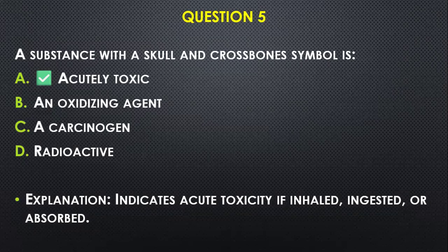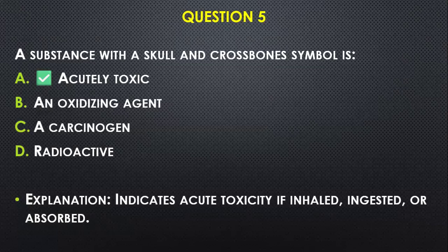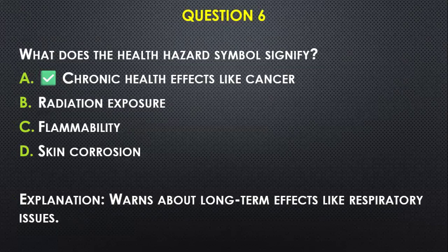Question number five: A substance with a skull and crossbones symbol is — A) acutely toxic, B) an oxidizing agent, C) a carcinogen, D) radioactive. When you see a skull with crossbones it is a sign that the substance is acutely toxic — it is toxic if you inhale it, ingest it, or absorb it.